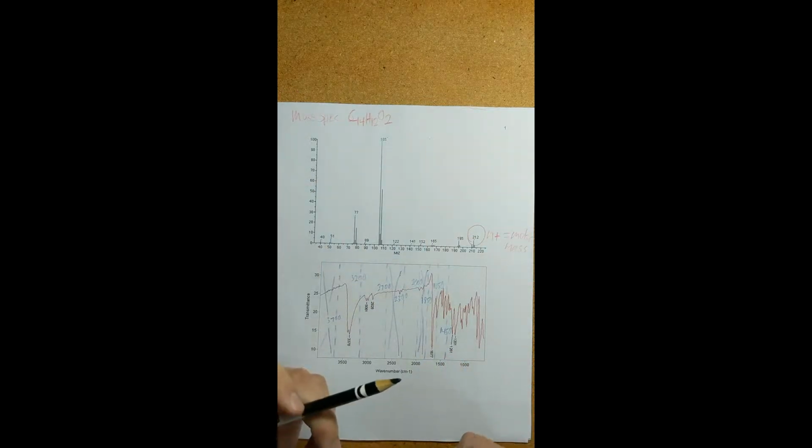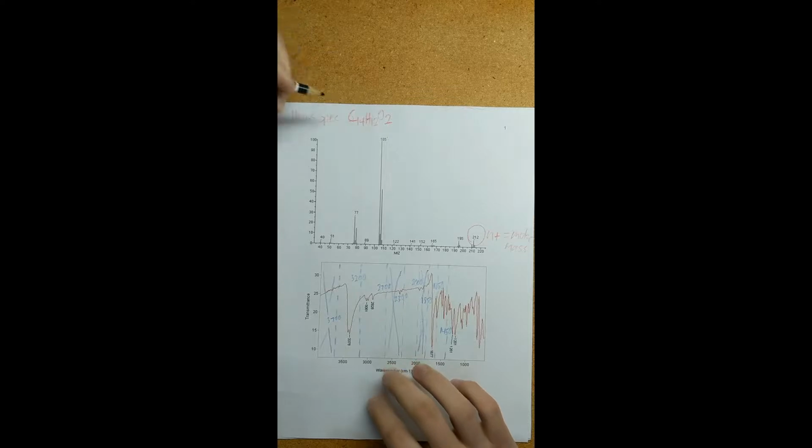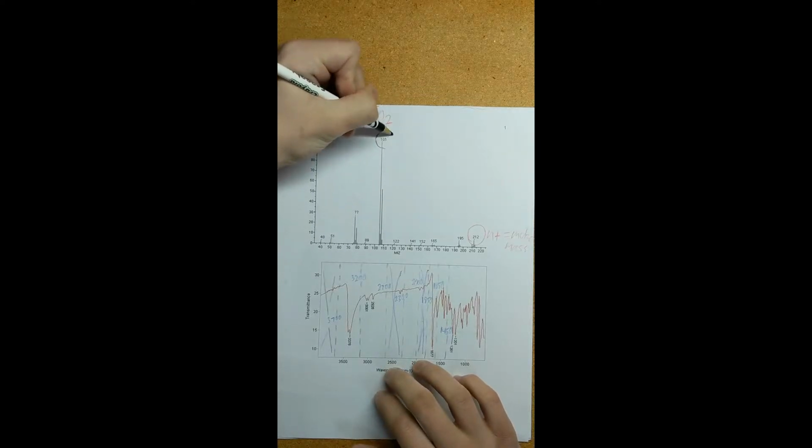The next thing we're going to take a look at is our base peak, which is our tallest peak, which obviously we can see here at 105.